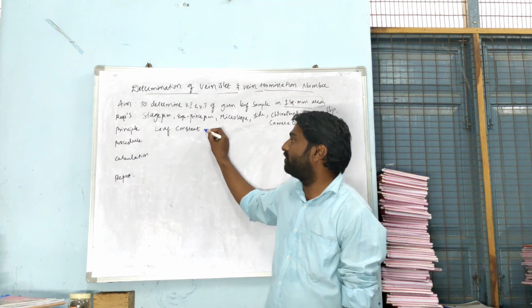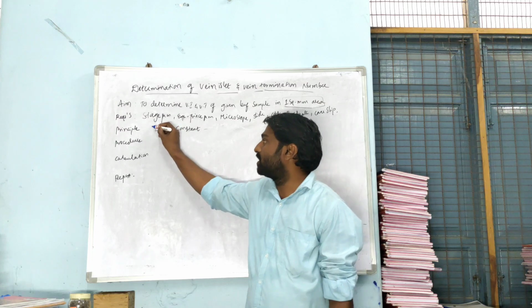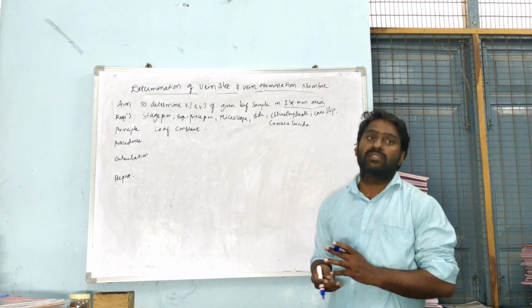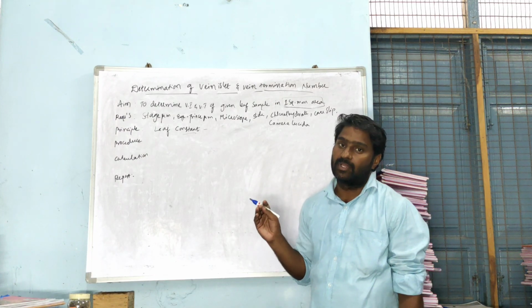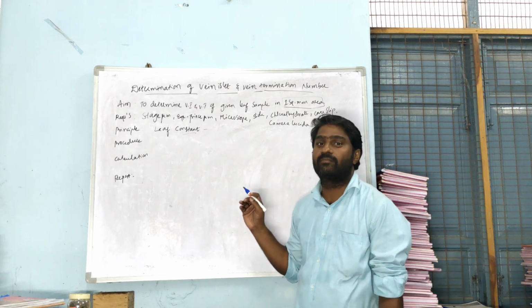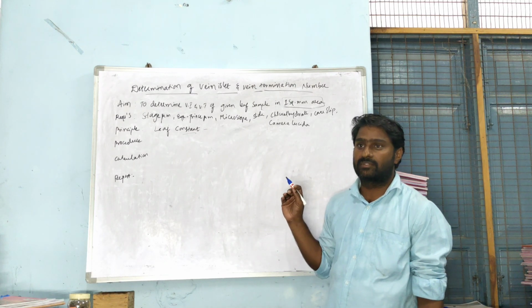So since it is involving qualitative and quantitative microscopy, it falls under the leaf constant, since we are using a leaf sample here and the values are said to be constant as long as the leaves that we collect are from the same kind of plant and same kind of species. So when a plant belongs to same genus and same species, definitely the leaf sample collected from such plants has the same values which are mentioned already in the standard books.